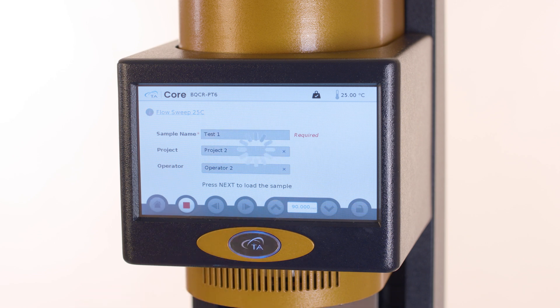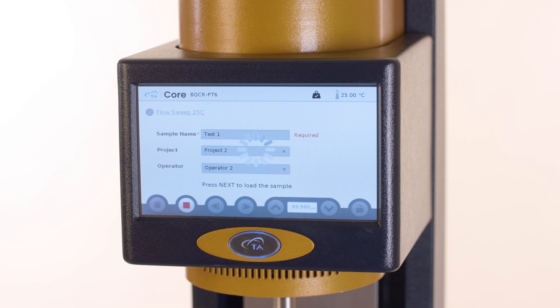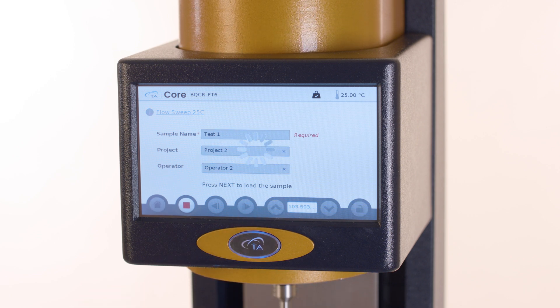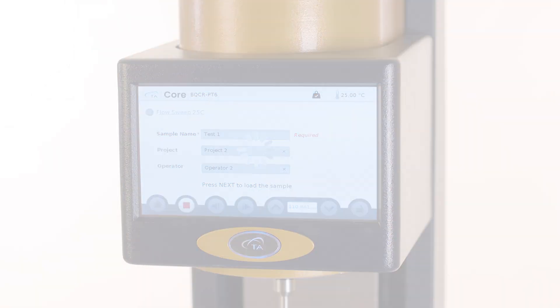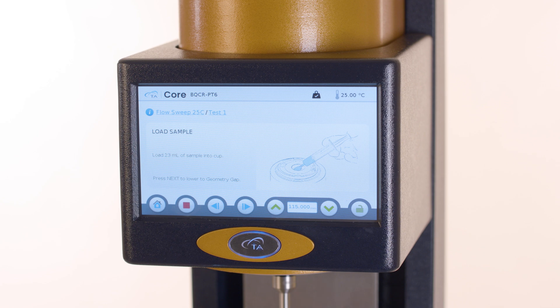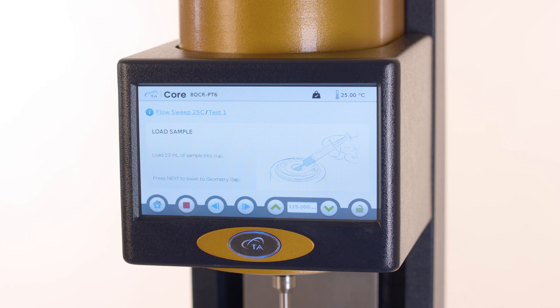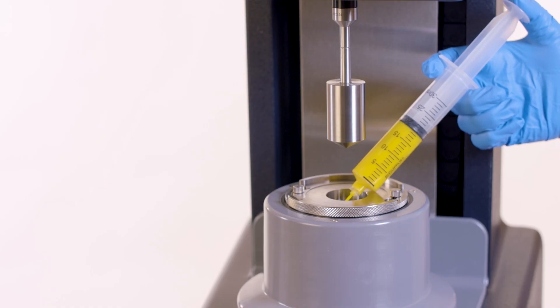Selecting a project and picking an operator are optional. Select the sample loading. In this example, the user transfers sample to the cup with a syringe.